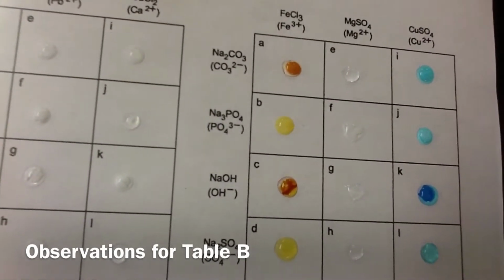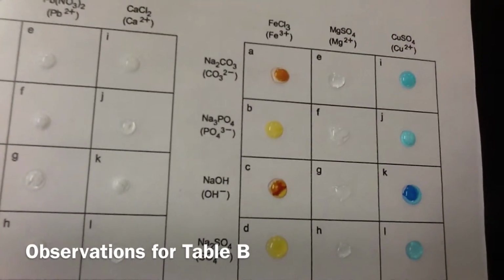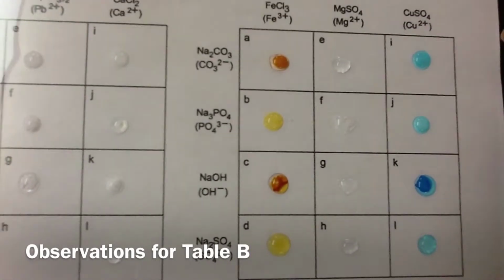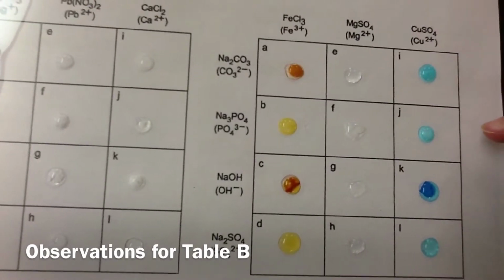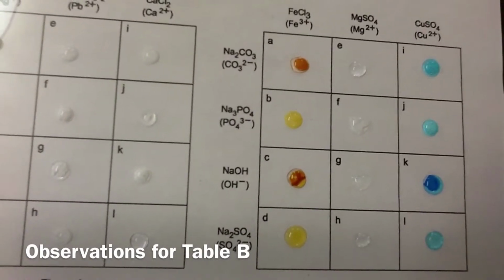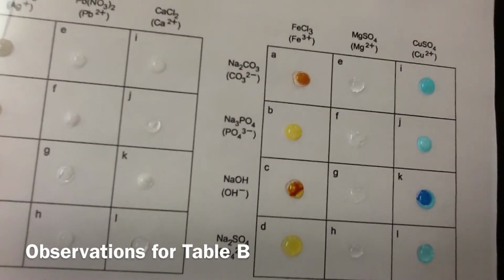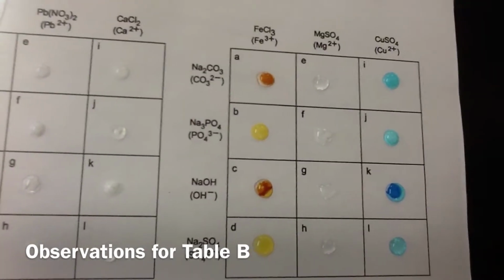no precipitate formed. Now when CuSO4 mixed with Na2CO3, a precipitate did form, and although it might be hard to see on the camera, there is a lighter or darker blue cloud floating at the top. And when Na3PO4 mixed with CuSO4, again a lighter milky substance formed at the top, meaning that a precipitate did form. Also, when CuSO4 mixed with NaOH, a dark blue precipitate formed on the top. And when CuSO4 mixed with Na2SO4, no precipitate formed.